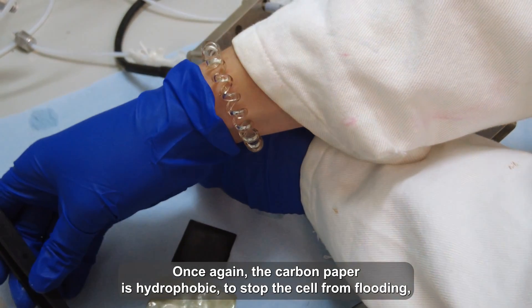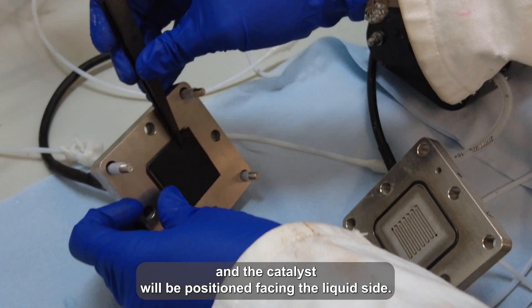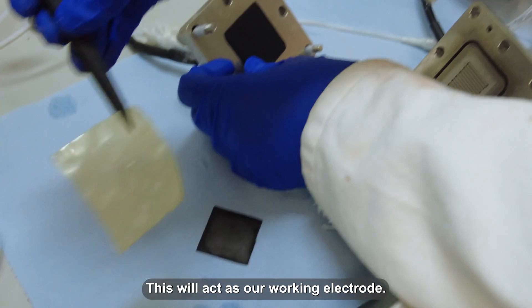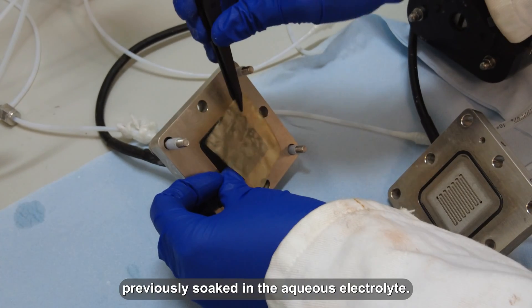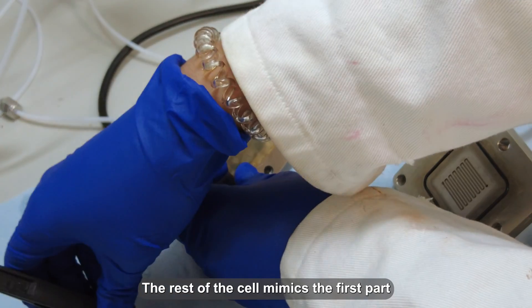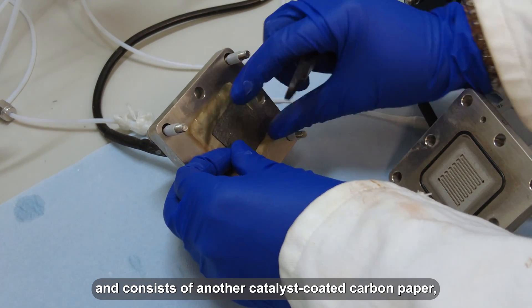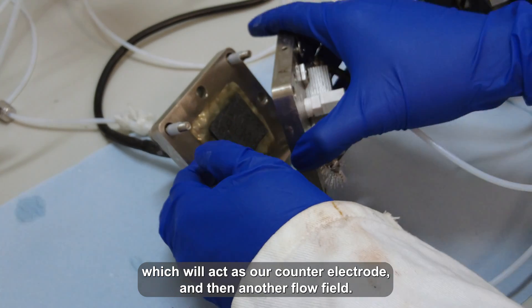Once again, the carbon paper is hydrophobic to stop the cell from flooding, and the catalyst will be positioned facing the liquid side. This will act as our working electrode. At this point, we can add the membrane, which has been previously soaked in aqueous electrolyte. The rest of the cell mimics the first part, and consists of another catalyst-coated carbon paper, which will act as our counter electrode, and then another flow field.